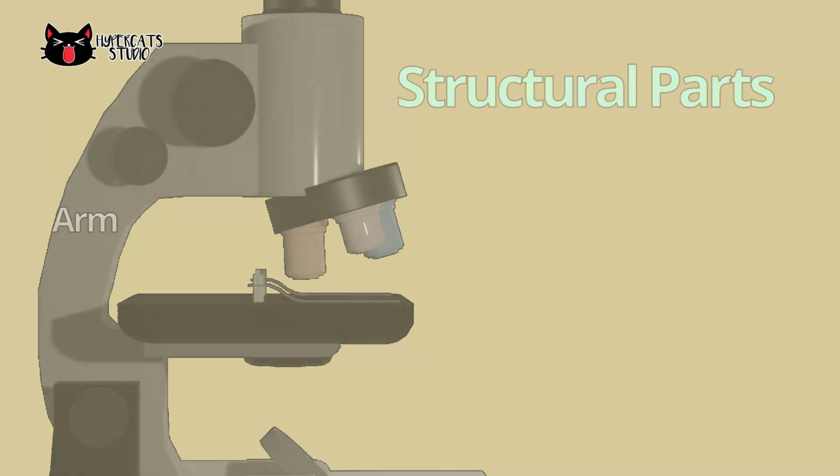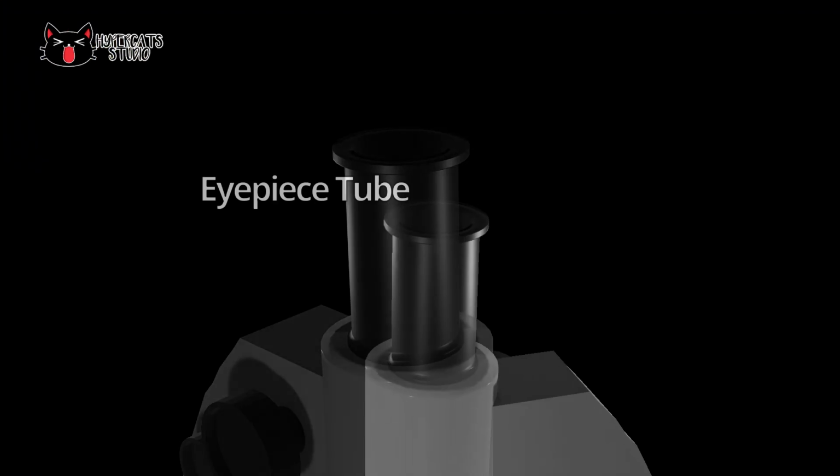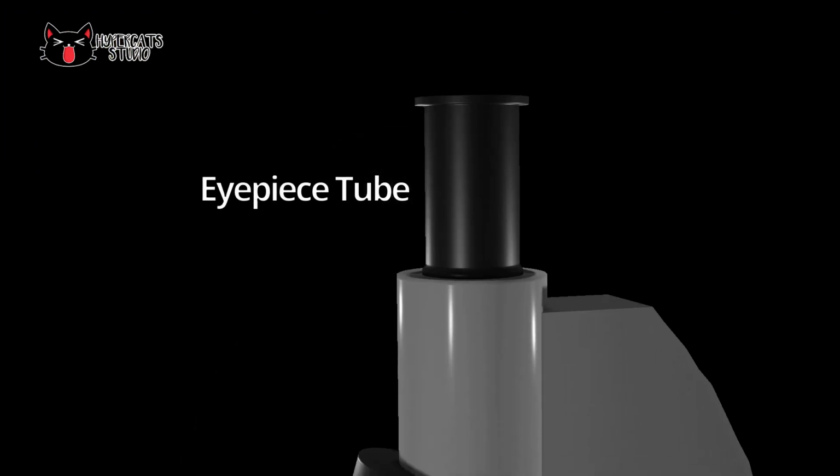The optical parts of a microscope are used to view and magnify a specimen placed on a slide. These are the parts. An eyepiece, also known as the ocular, is where the observers look through the microscope. Its standard magnification is 10 times, with an optional eyepiece having 5 to 30 times. The eyepiece tube holds the eyepiece.